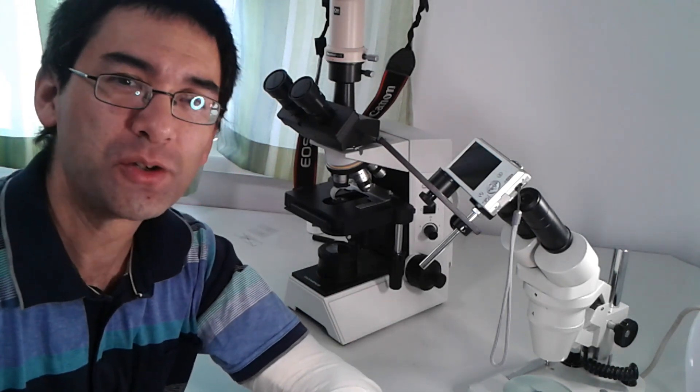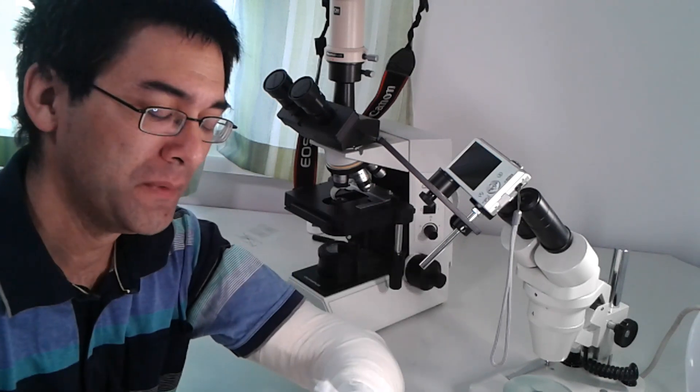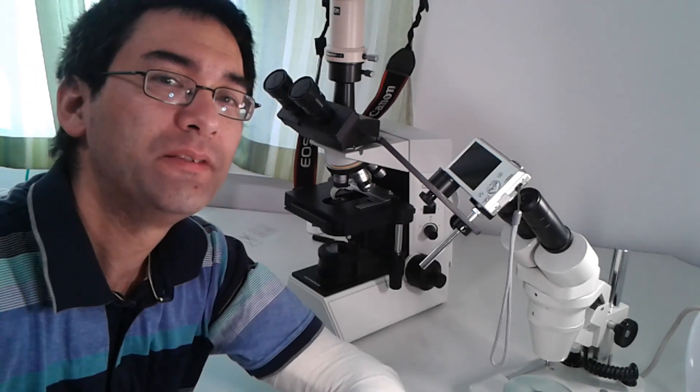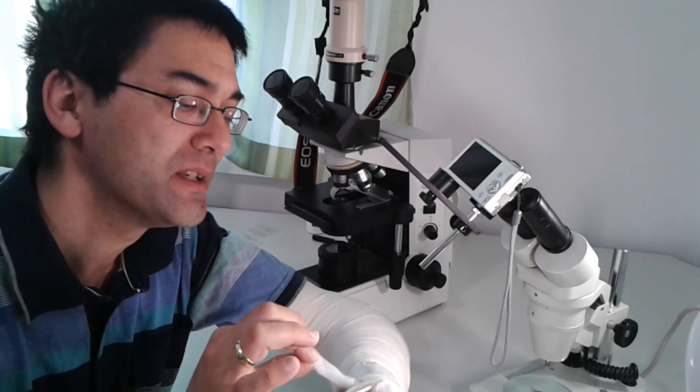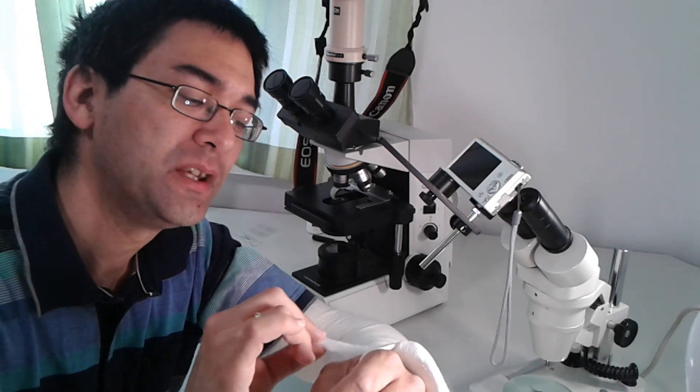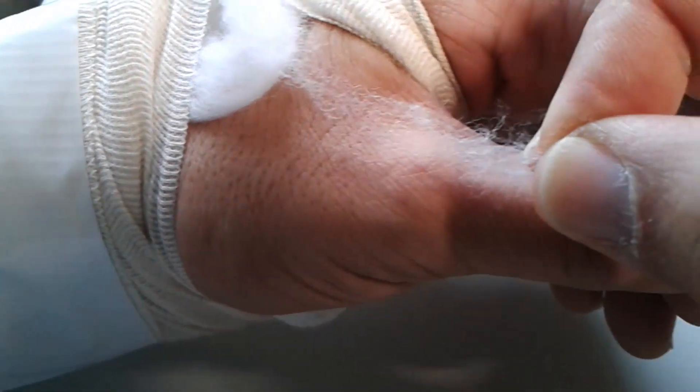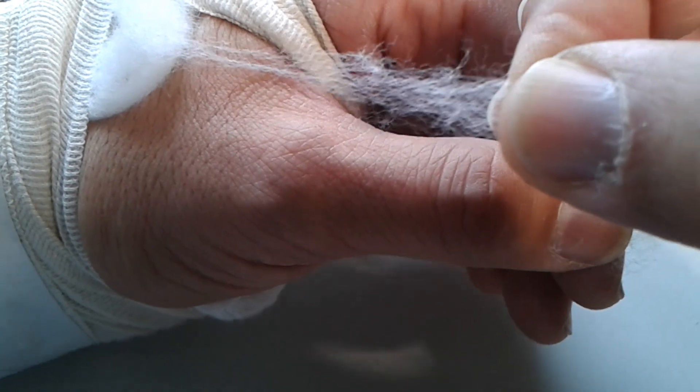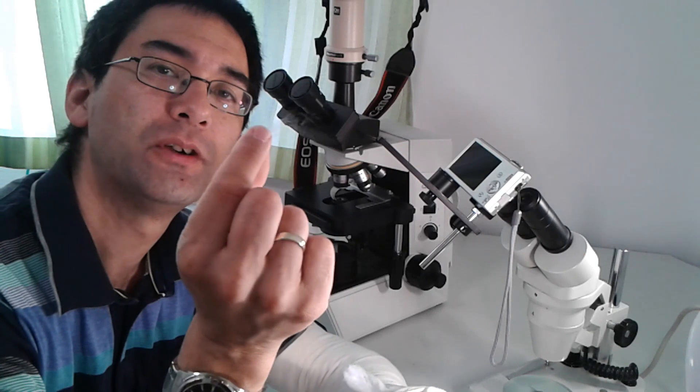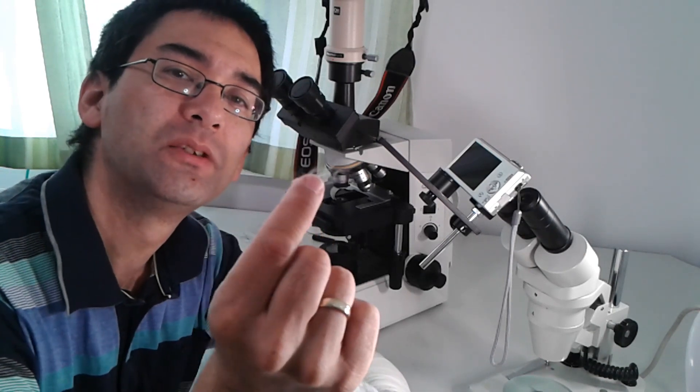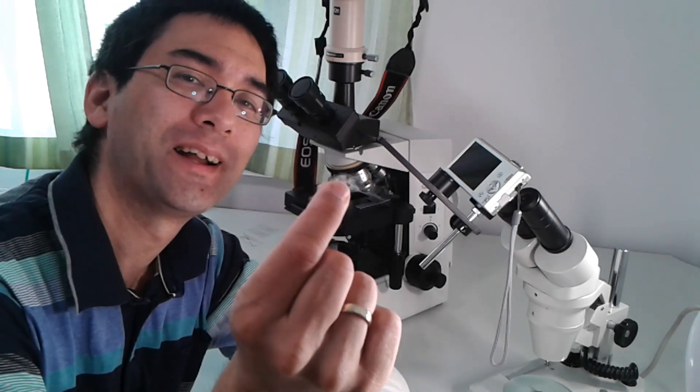It's a little bit annoying as well because I cannot drive my car anymore, but there is one advantage to the whole thing because I've seen that beneath the cast there is this fibrous material. It's not cotton. It seems to be some kind of a synthetic fiber. That is basically the material that I wrapped my arm in before I put on the cast, and I think that this stuff here would be quite interesting to look at under the microscope. Let's do that.